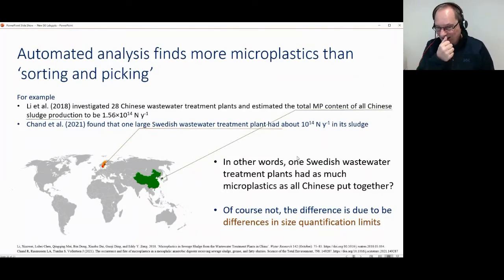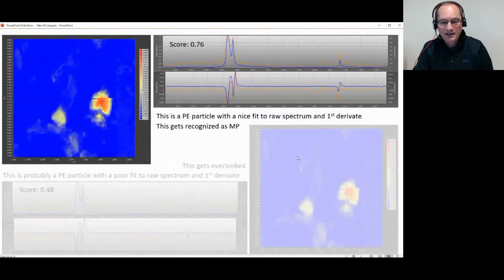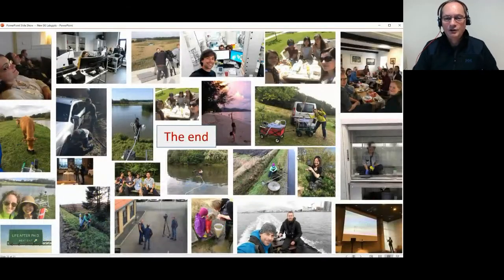So it's not as problematic if you have mass. Then you would have been much closer in the comparison. Also, if you had only looked at the big particles. So I think it's super important to remember both mass and size matters. So I'll just jump the last slides now because otherwise I will never get finished.